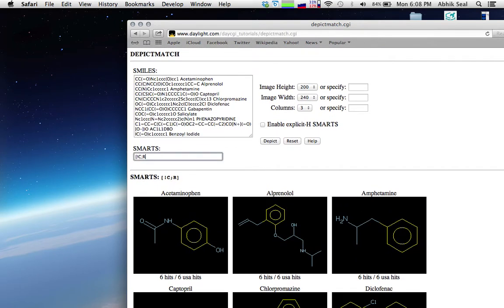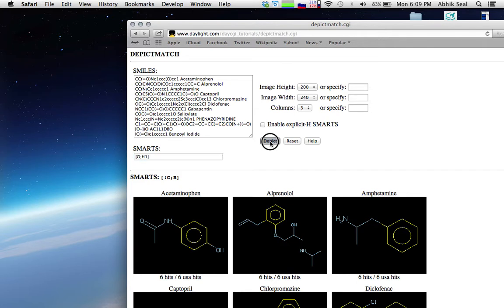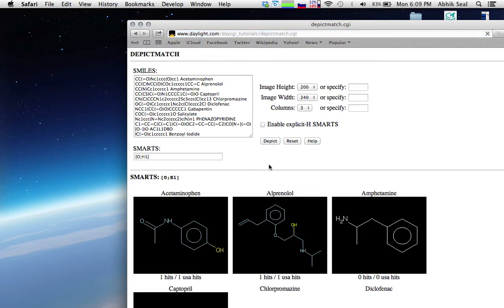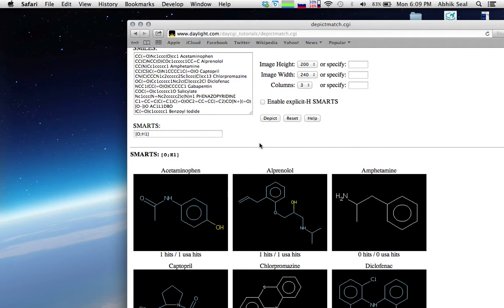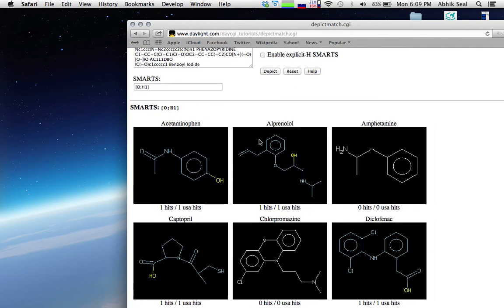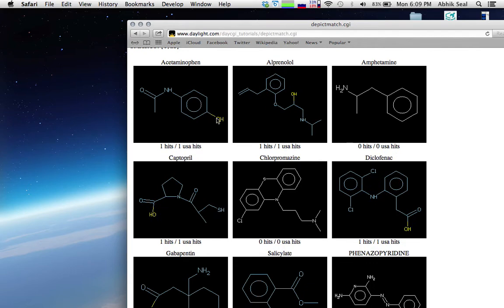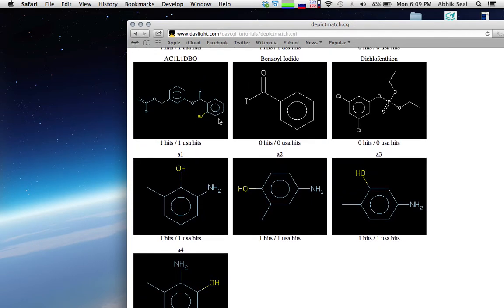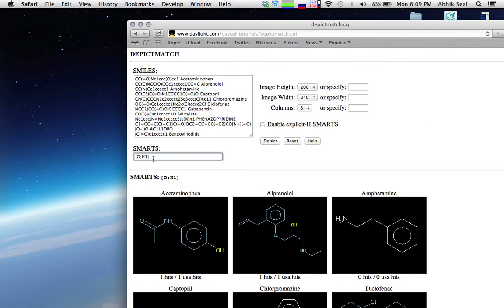Let's do another one. Suppose I want all the hydroxyl groups. The format is O;H1 — the oxygen semicolon H1 — and it will identify all the hydroxyl groups in your dataset. You can see it matched only the hydroxyl groups for all these compounds.